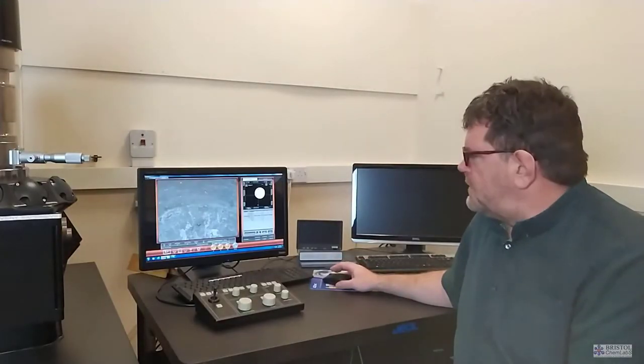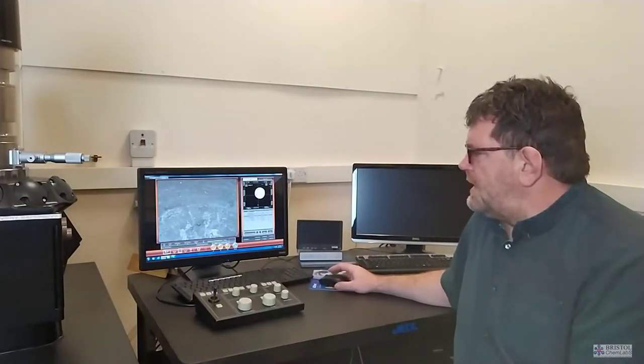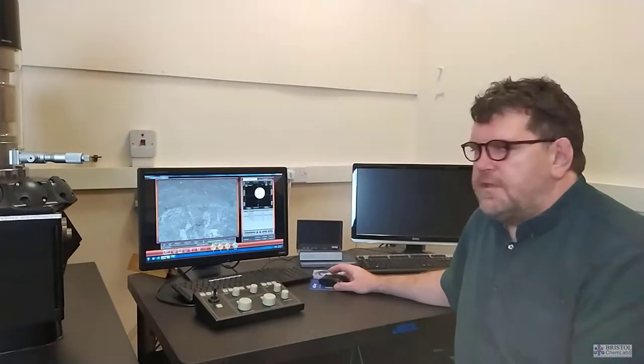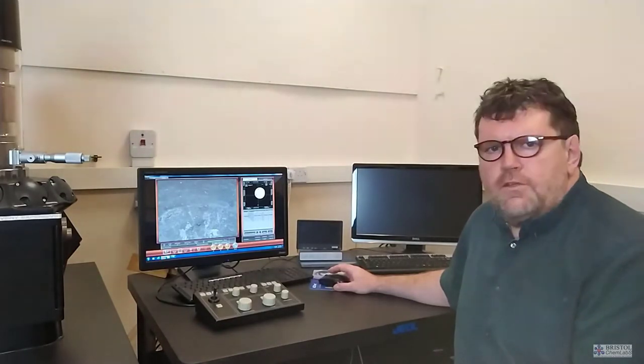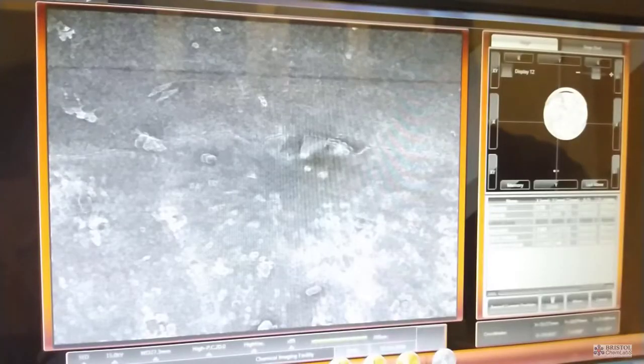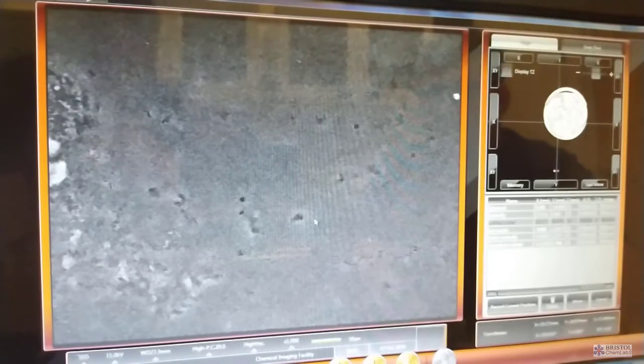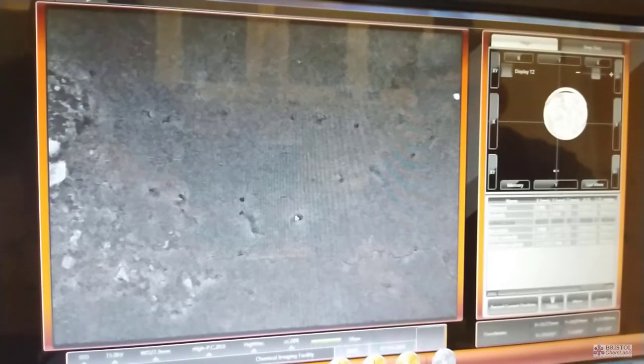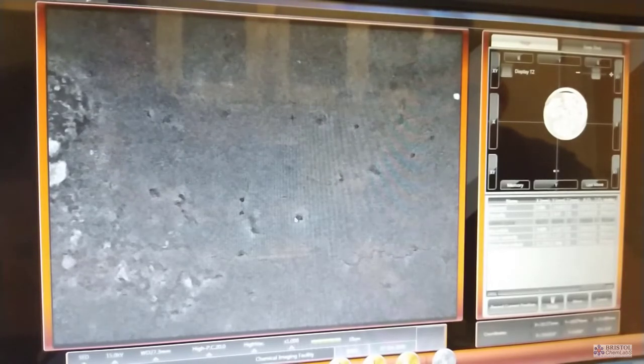We've now moved on to the second sample. In this case, it's actually what are called colloidal particles. These are very small particles which when dried down and deposited on the surface are close packed together, much like ions within a crystal. At this magnification of 50 times, we don't see much structure in the material. But as we zoom in, we're going from 50 times up to 1,000. You can begin to see some features. The dark patches here are holes.